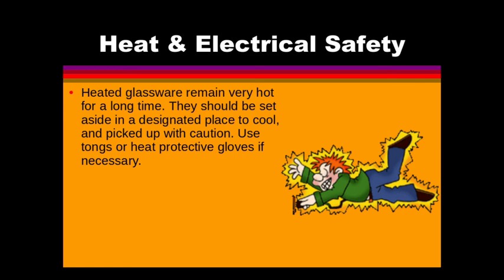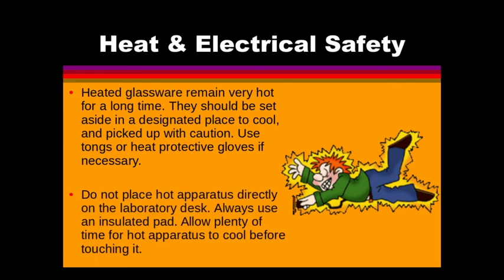Heated glassware remains very hot for a very long time. They should be set aside in a designated place to cool and picked up with caution. Use tongs or heat protective gloves when necessary. Please remember the glassware when it's hot looks just like it does when it's cold. You cannot tell the difference. Do not place hot apparatus directly on the lab desk. Always use an insulated pad, kind of like a hot pad. Allow plenty of time for the hot apparatus to cool before touching it.